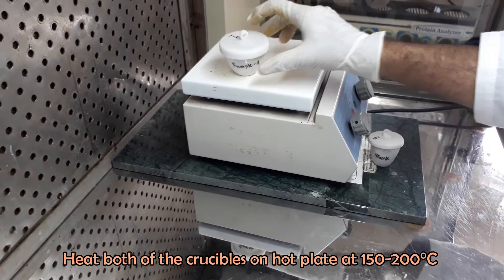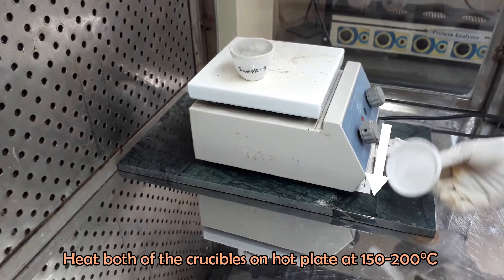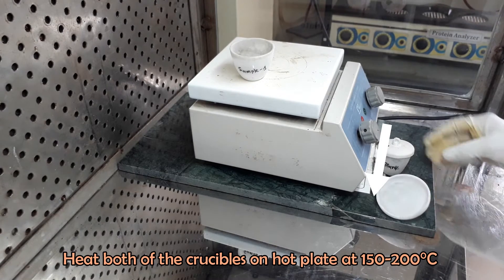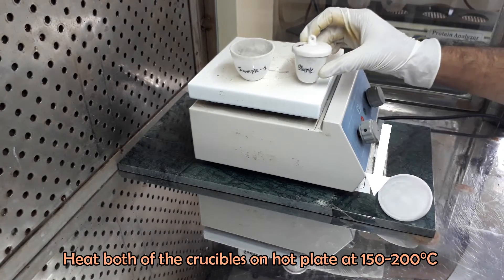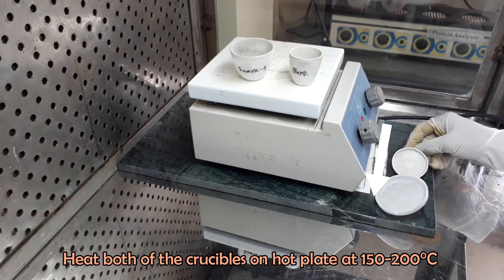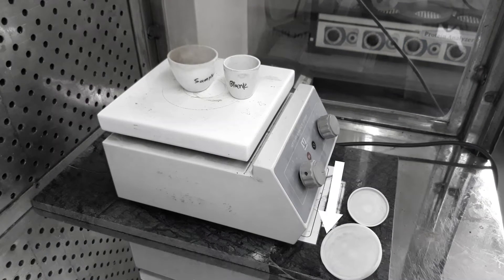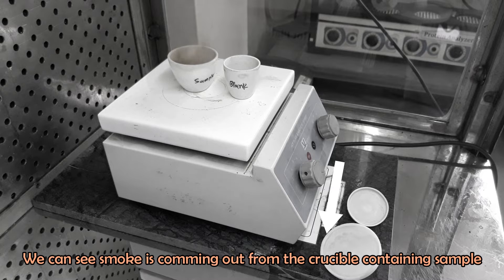Heat both of the crucibles on hot plate at 150 to 200 degrees Celsius. We can see smoke is coming out from the crucible containing sample.